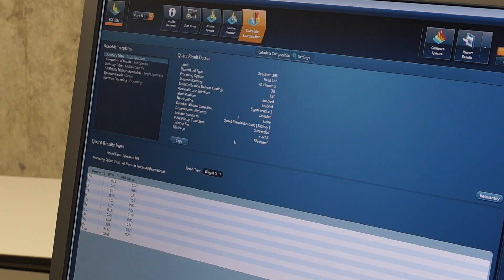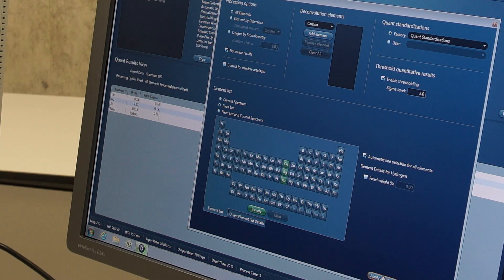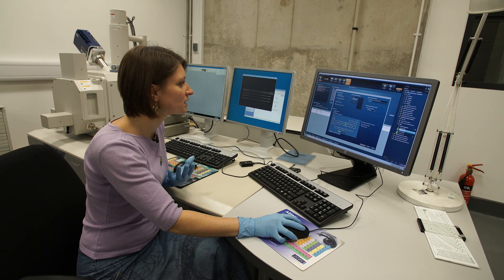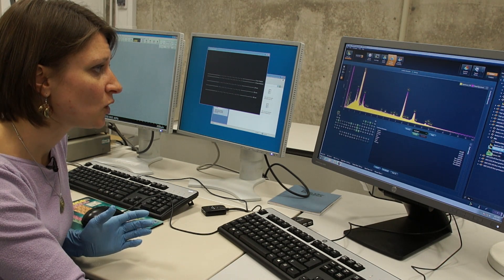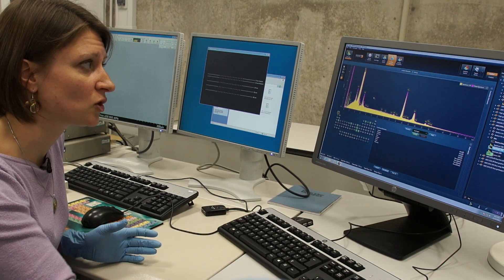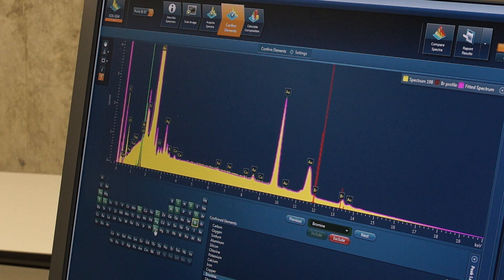The software also allows you to quantify. Here I have chosen to highlight gold, silver and copper, which are the alloying elements for this alloy. I can see that on this particular object and on this particular area, there is about 90% gold, about 9% silver and very little copper. So we get two types of results: the spectrum, where we can check whether the elements the software detects are really there, and then the quantified and normalized results.